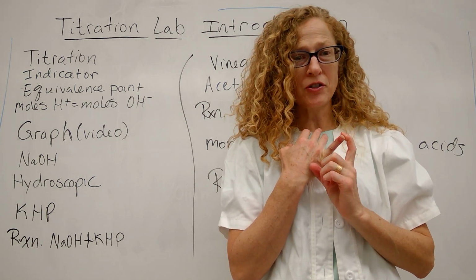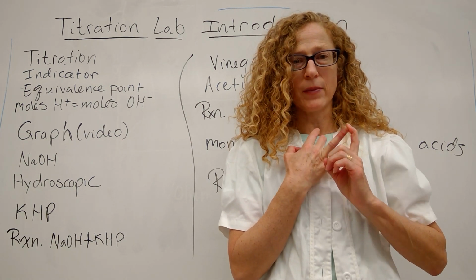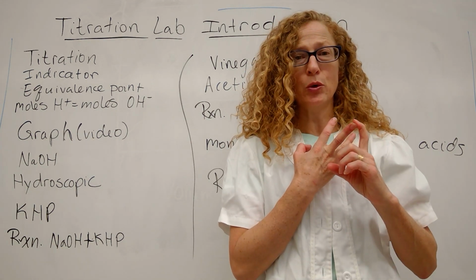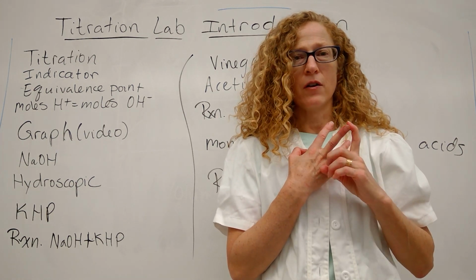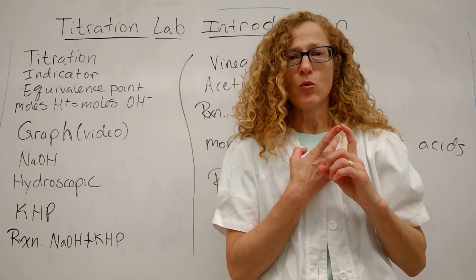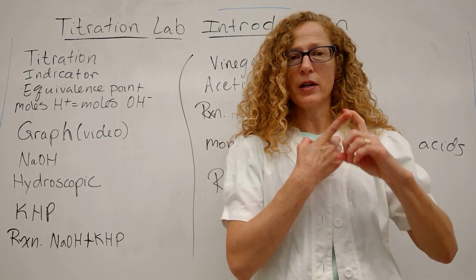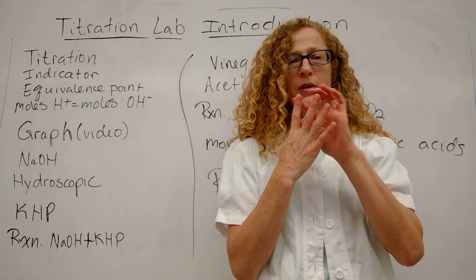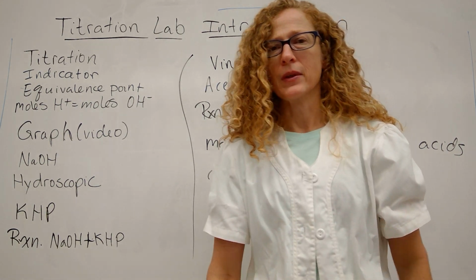First, before the lab starts, you should have your introduction. After part 1, when you get the molarity of sodium hydroxide. After part 2, when you have the percent by mass and the molarity of vinegar. And part 3, when you figure out the molar mass of your unknown acid and what is your unknown acid. So you're really going to be coming to your instructor 4 times for signatures through this lab.